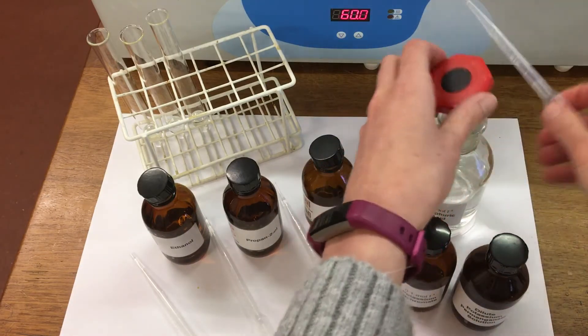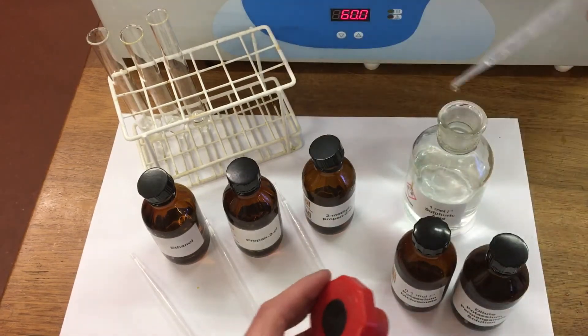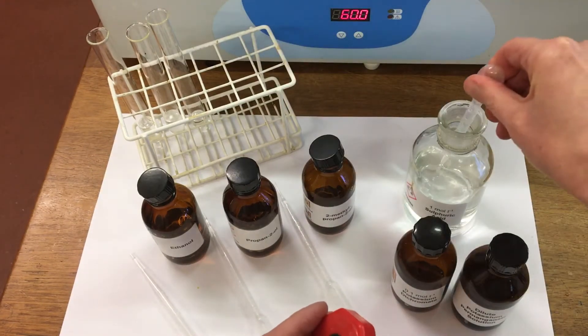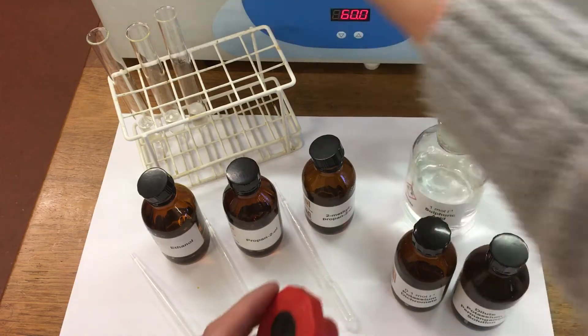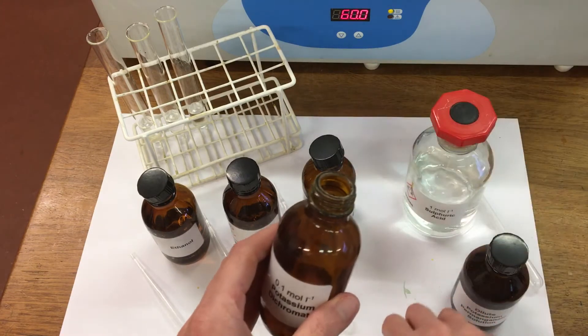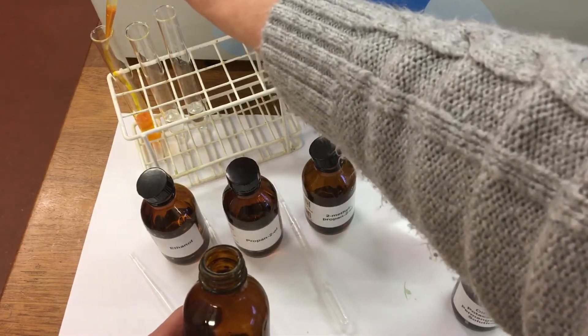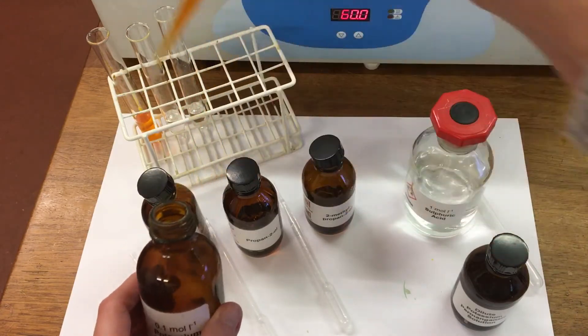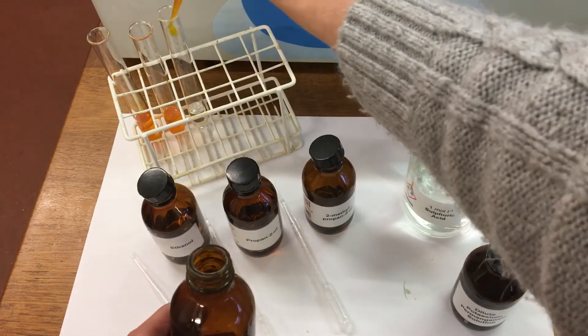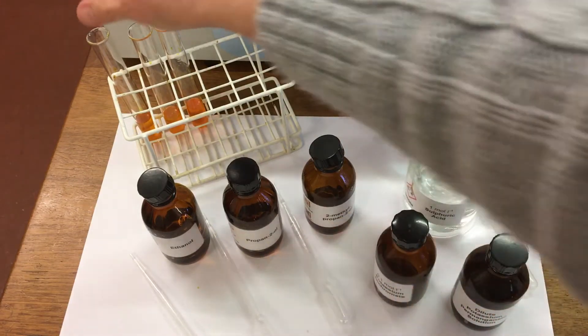I'm then going to pop some sulfuric acid into each test tube. And then our first oxidizing agent is potassium dichromate. I'm then going to mix each test tube.